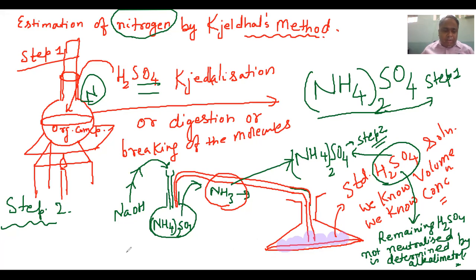So in this reaction, if we see NH3 plus H2SO4 is forming (NH4)2SO4.